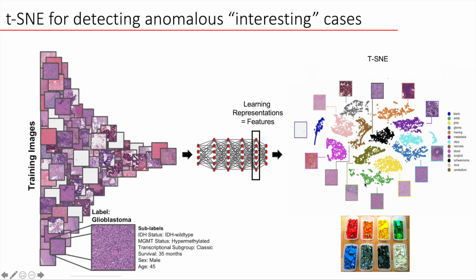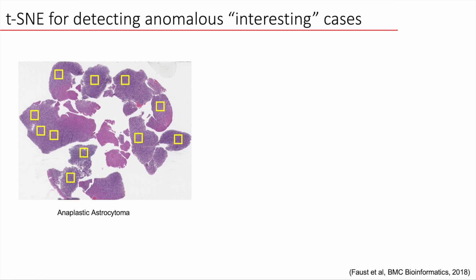So you can see that this t-SNE is meant to reproduce this binning approach, where you can see these individual bins, and of course there's space in between where other bins can also be inserted if need be. So let's look at what that looks like.